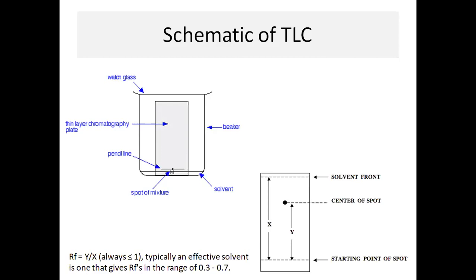from the point of application to the solvent front, but not exactly to the level of the solvent front. Is that clear?